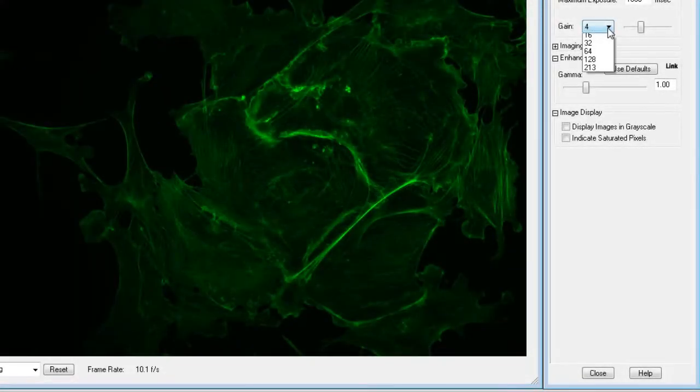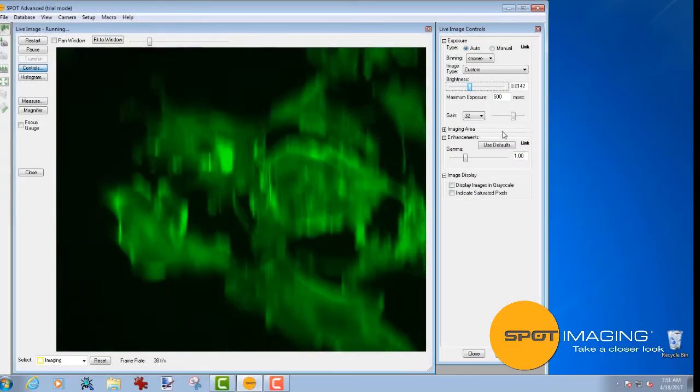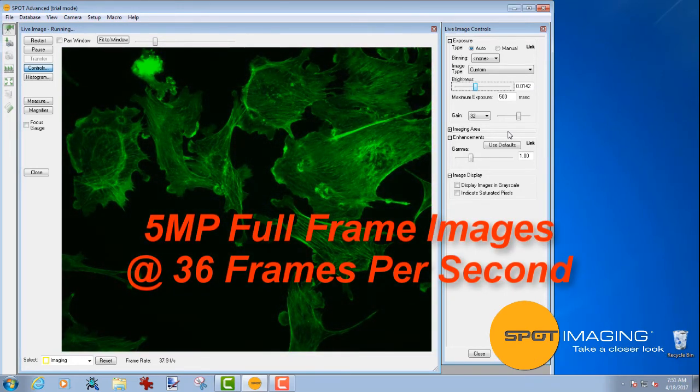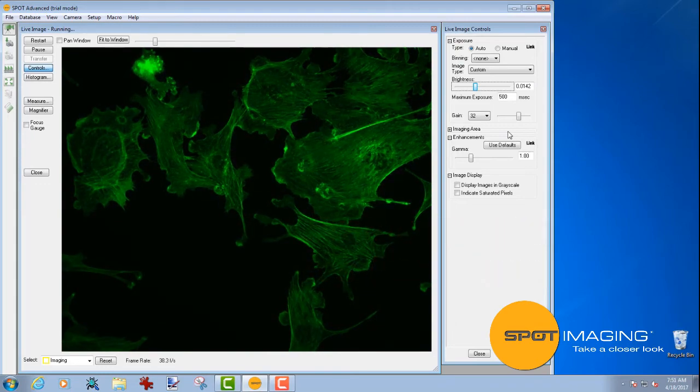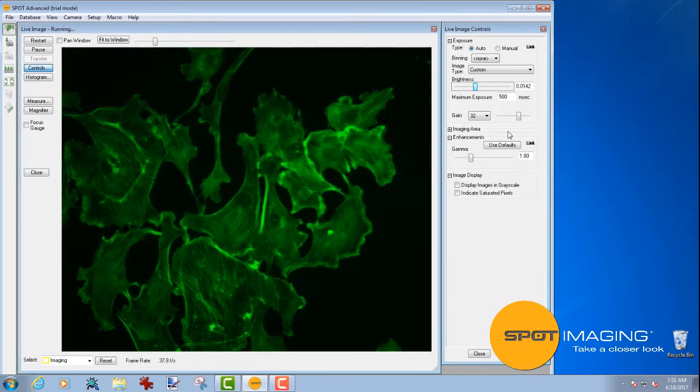If you are looking for even shorter exposure times, this camera allows you to increase the gain within Spot software without sacrificing image quality. This 5 megapixel camera is capable of capturing full-frame images at 36 frames per second. Let me show you how the camera's speed works with the Spot software auto-exposure feature to help you quickly track down those important areas of your specimen.